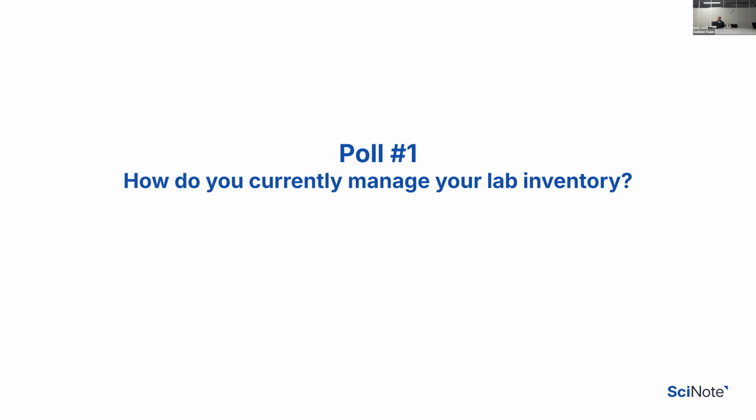I think all of you should see the poll already on your screens. You have multiple options, so you can click on multiple ones. If your option is not in the poll, please put it in the chat. Very curious to hear what we have missed and what you have been using. Let me move the chat here.